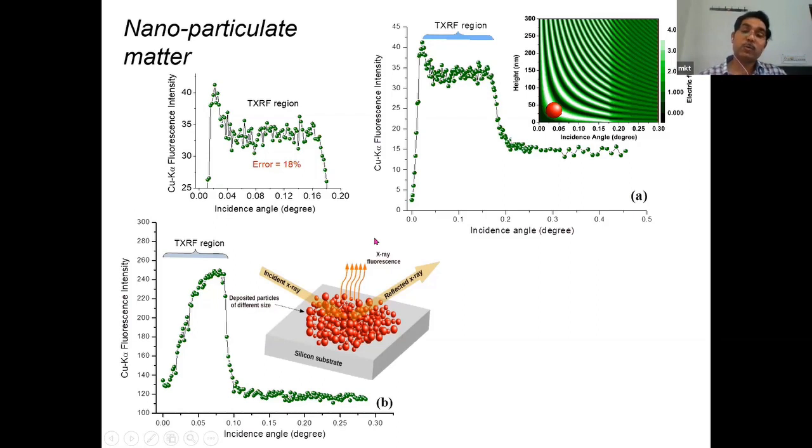If you put a large amount of nanoparticles, even if particles are there, but you put them in a large amount, the absorption also comes into account. Then the intensity also decreases. Same particle, everything is same. Here we slightly dispersed them; here we have not dispersed, but put them over a large surface.